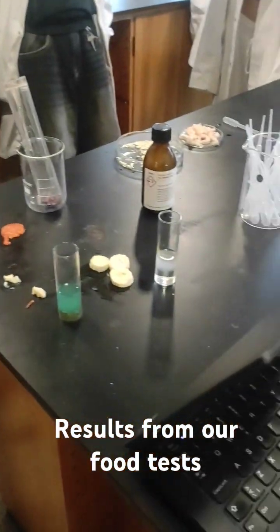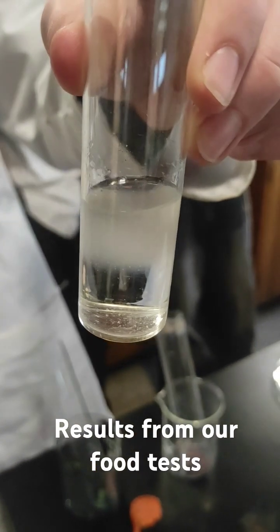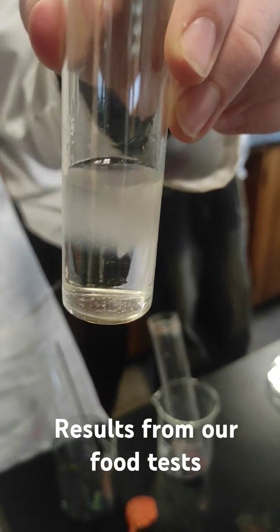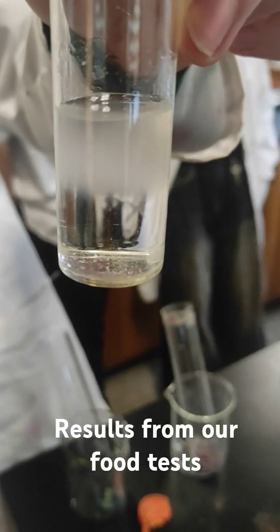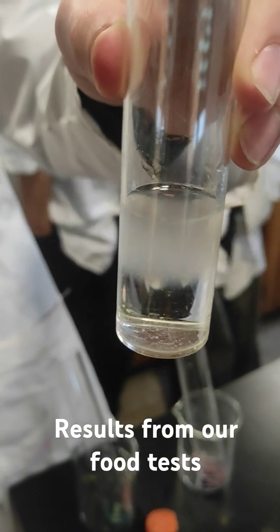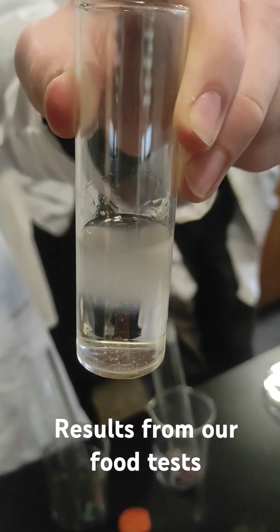Then we have our fat test. In our fat test here, we can see the white layer on top. The white layer is fat mixed with alcohol, where the clear below is pure water. This here was done with salami, so we can see there's a high fat content in our salami.